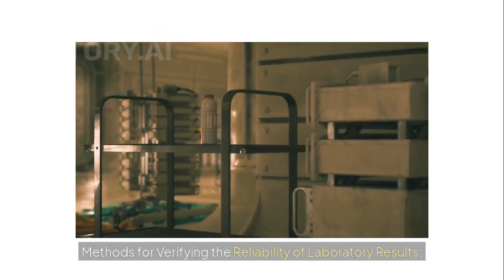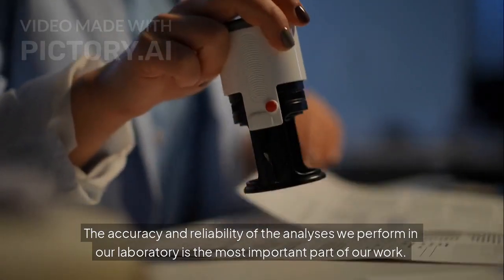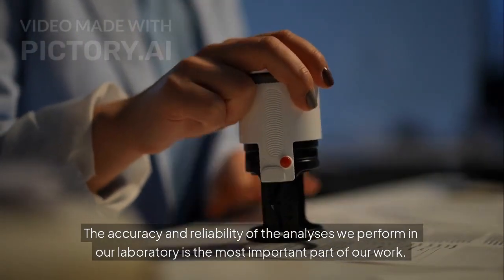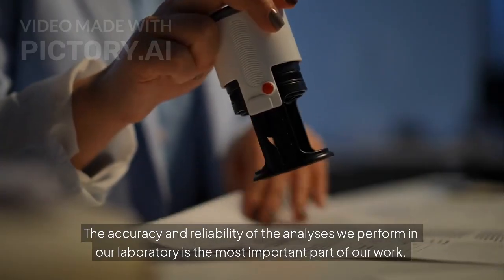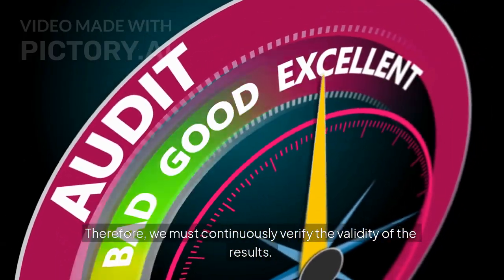Methods for verifying the reliability of laboratory results. The accuracy and reliability of the analyses we perform in our laboratory is the most important part of our work. Therefore, we must continuously verify the validity of the results.